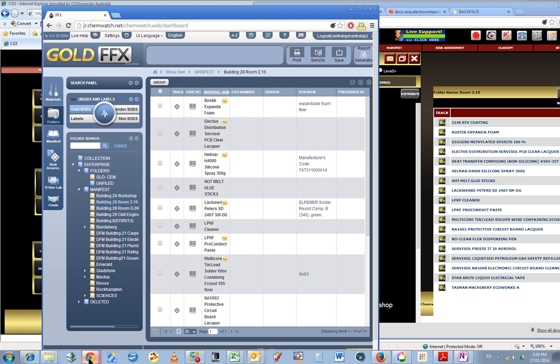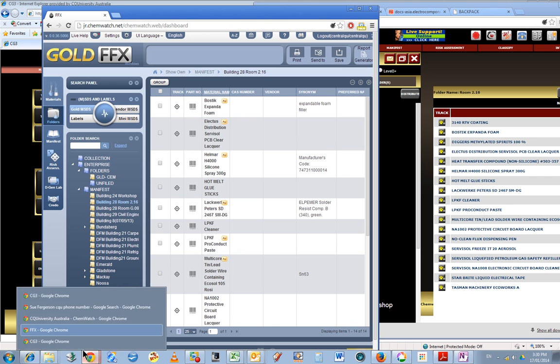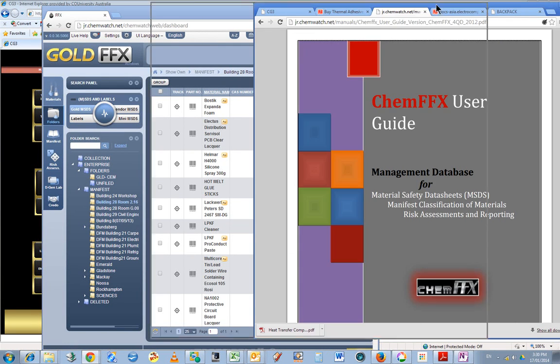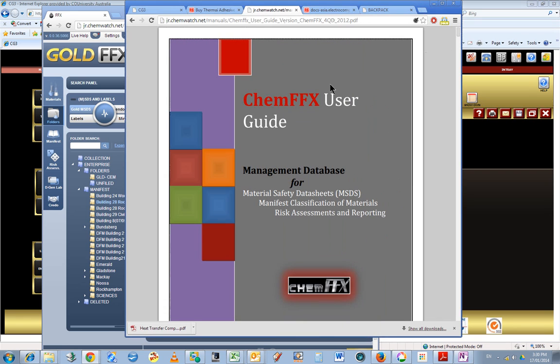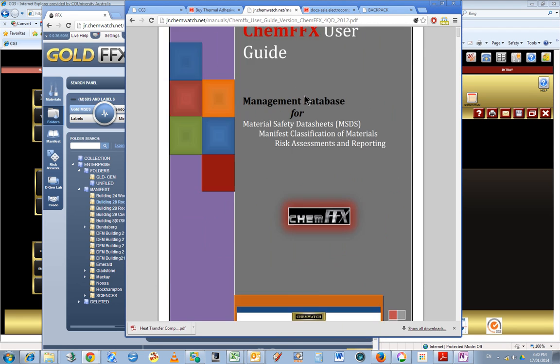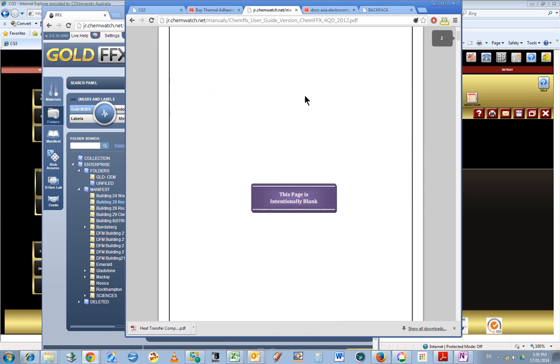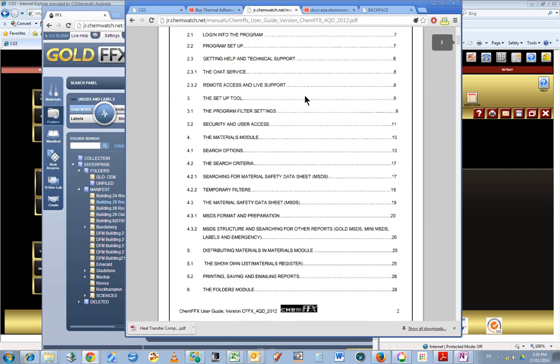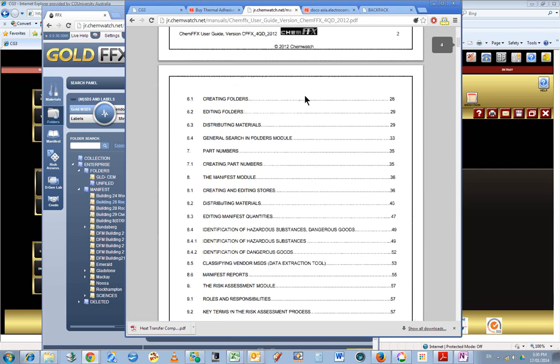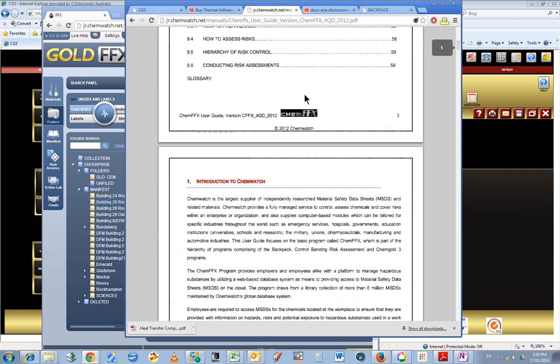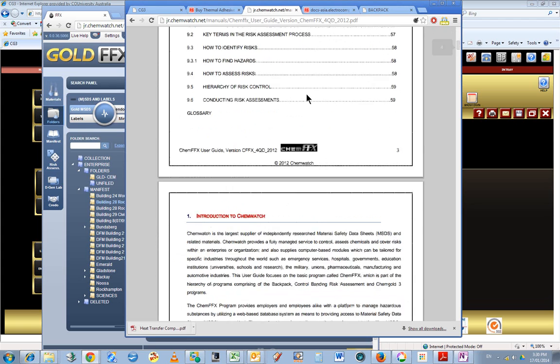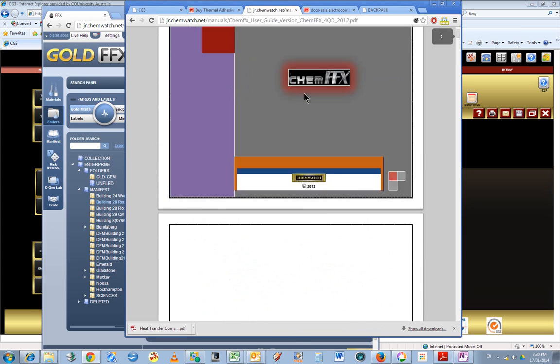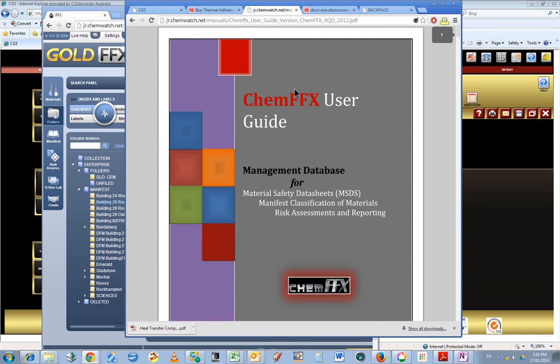Incidentally I typed in user guide, so here we have the ChemFFX user guide. I just googled that, so it's not like it's secret information or anything. That should provide good help to get started using this MSDS management software.